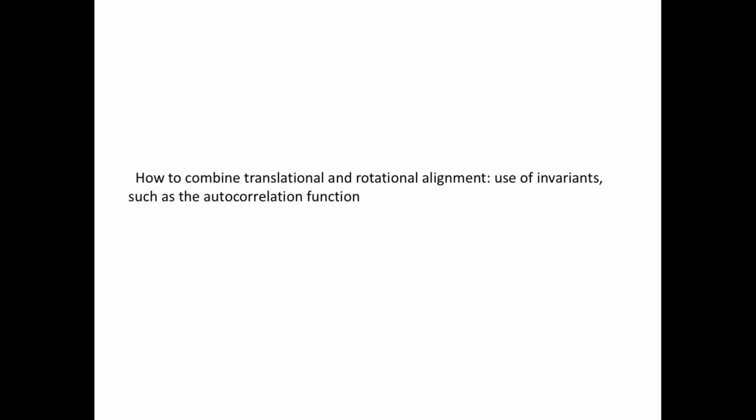So now there's a way of doing this by using invariants, such as the autocorrelation function. The autocorrelation function is translation invariant, but it retains orientational features.